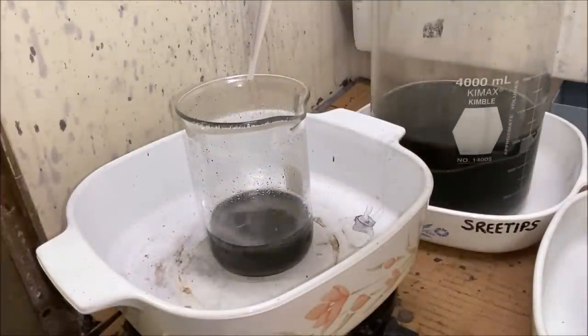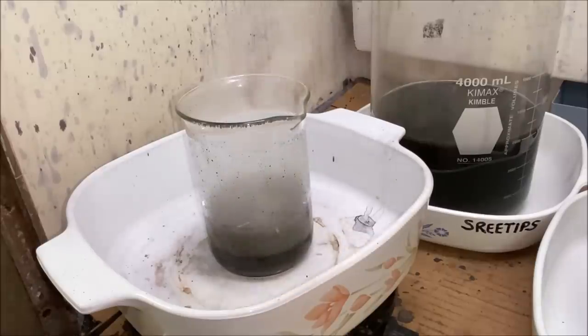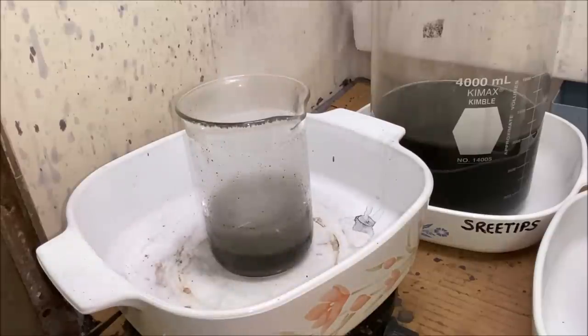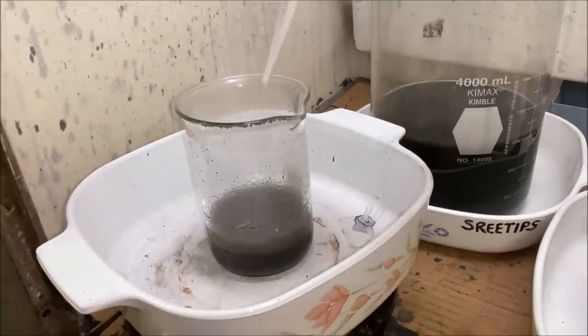I'm going to get some with a dropper. Start adding it by the dropper full in here. See if we can maybe dissolve off some of the carbon. Clear it up a little bit and perhaps convert it into something that will pass through our filter more readily.